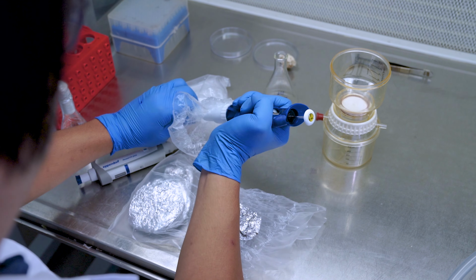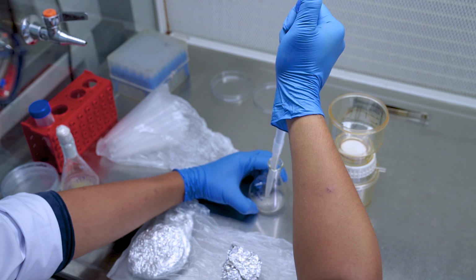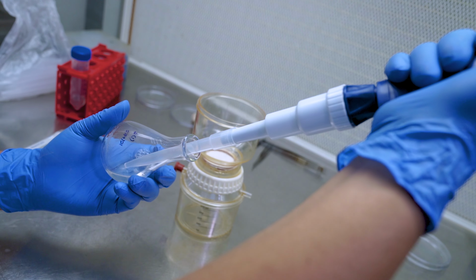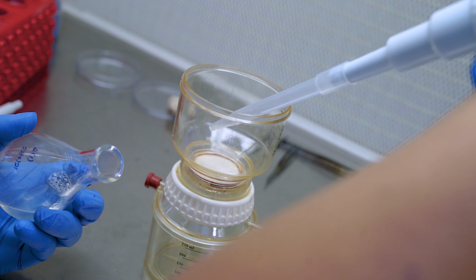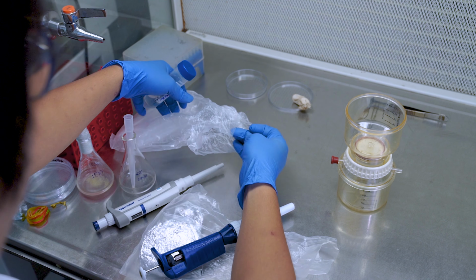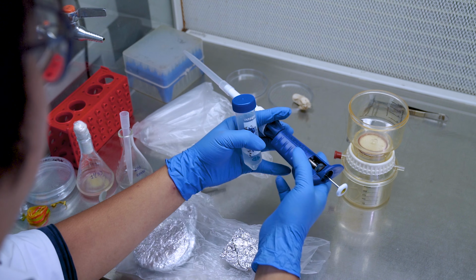For this, right now I am taking my embryogenic cell suspension, which contains my embryogenic cells, my embryogenic calli, and I will be putting it on top of the filter paper. This is around 15 ml of my ECS culture, and I will be infecting it with the Agrobacterium, which I have grown and cultured for 48 hours.